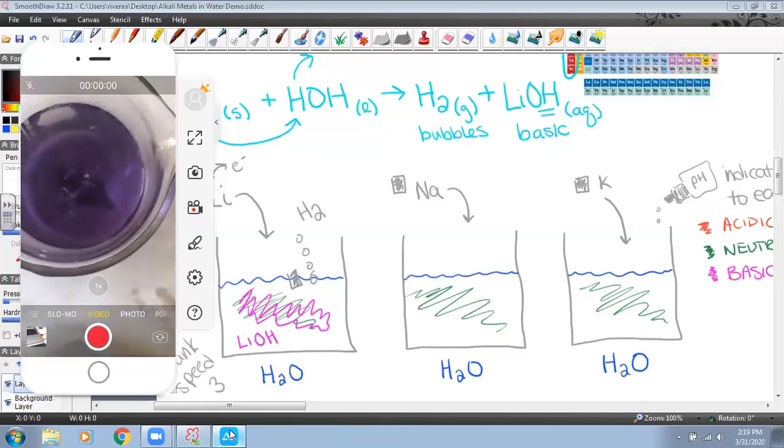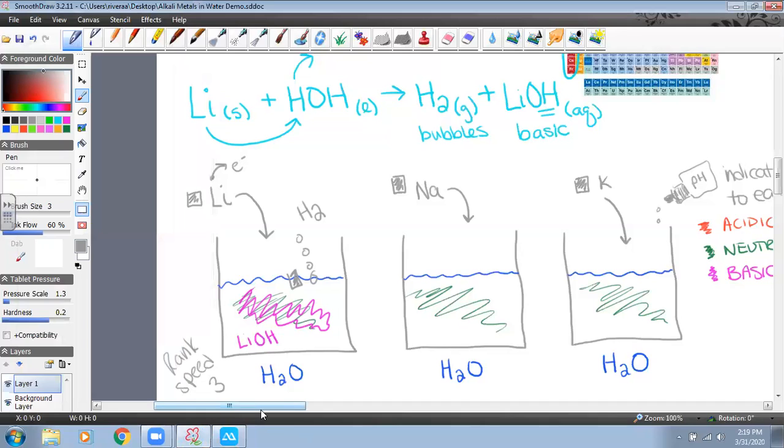Let's go back to our notes. Okay. So the sodium went into the water. A little chunk of sodium goes in. Oh, it just started reacting again. Hydrogen gas bubbling up at a much faster rate. Again, you guys might not have heard it, but it was bouncing all over the container, right? Which means that hydrogen gas was being produced a lot faster. It's the production of the bubbles of gas right around the piece of metal that send that piece of metal flying all over the beaker.